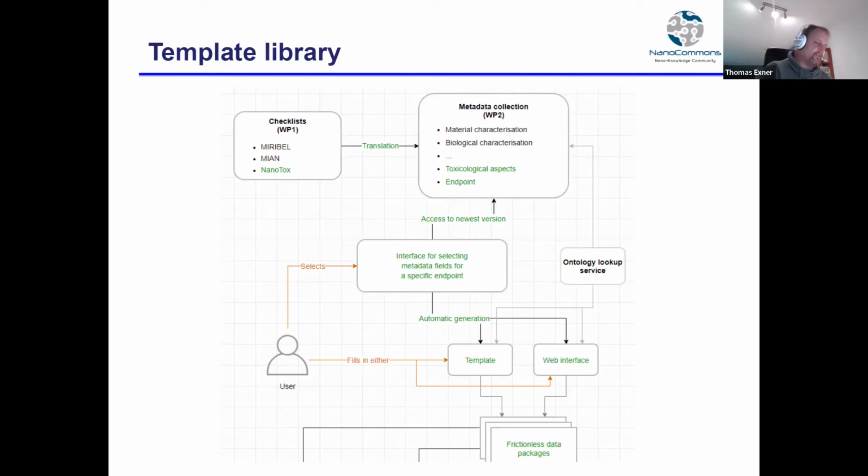If you say you have these, what I didn't remember the naming. Yeah, but if you say I need this control experiment for this type of cells, then you can take that and move it over into another study, and it will be the same. You don't have to think about new metadata standards for that, because it is the same part.